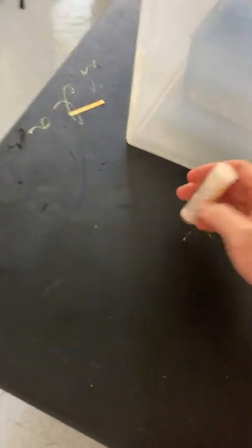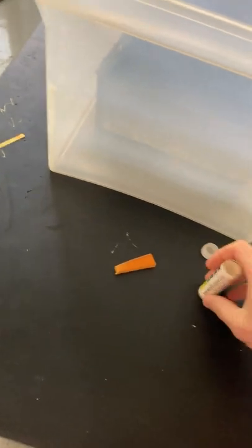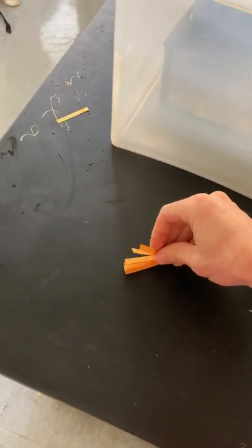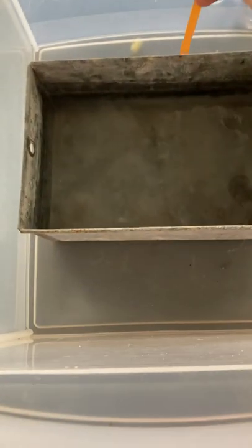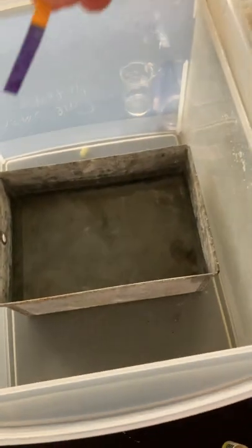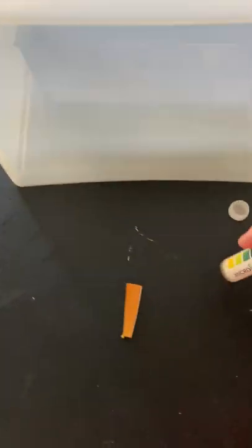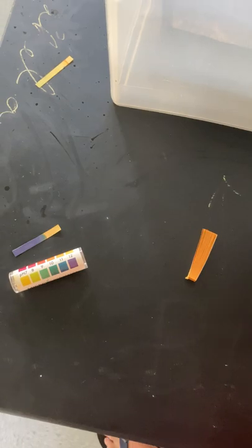There's one last thing — I'm going to test the pH of the water again. It's purple. Purple stands for high pH, so the water became very basic, or very alkaline.